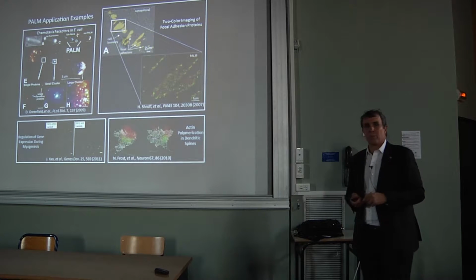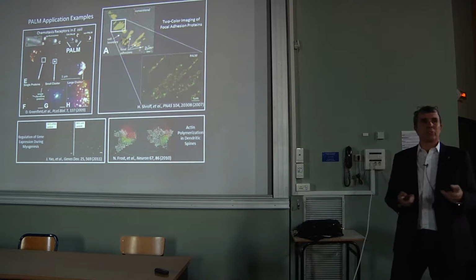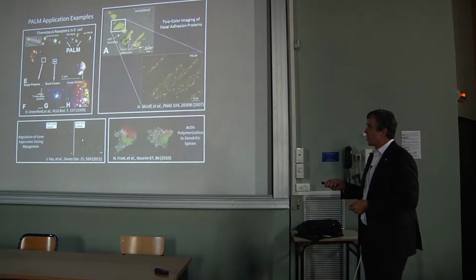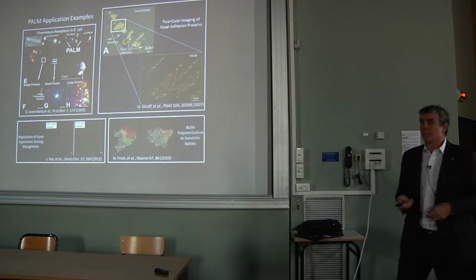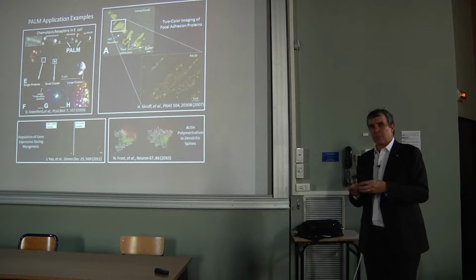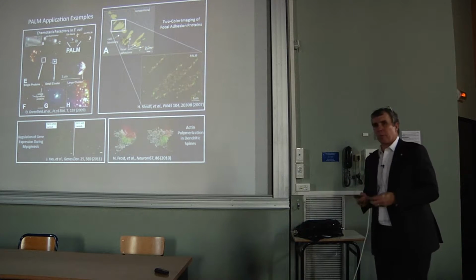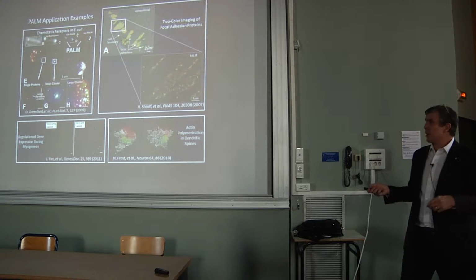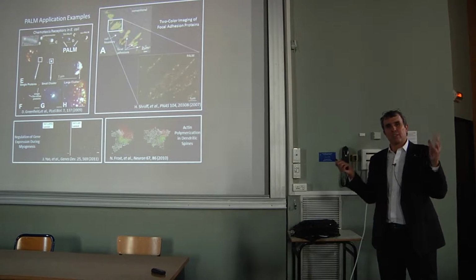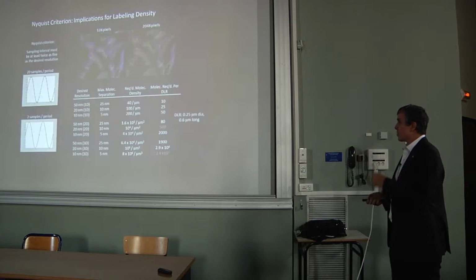In another example with Bob Tjian at Janelia, we were able to show that these green dots, which represent core promoters which are necessary for transcription of DNA, are spatially segregated from the genes which hug up against this red nuclear membrane. And that spatial segregation is one means by which the cell regulates when certain genes are turned on. And in another example, we were able to look at cultured neurons and show in the spines on the dendrites of these neurons that the cytoskeleton, which gives these things their shape, is only polymerized at certain discrete places in these dendritic spines.